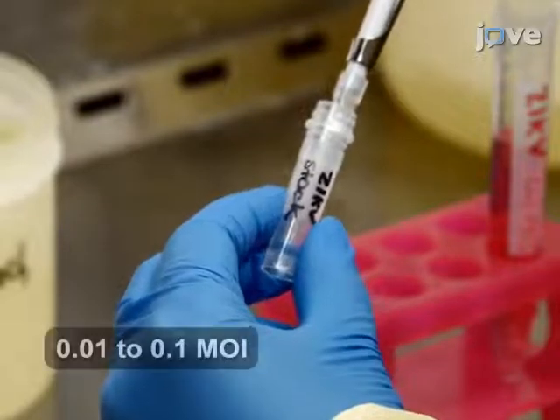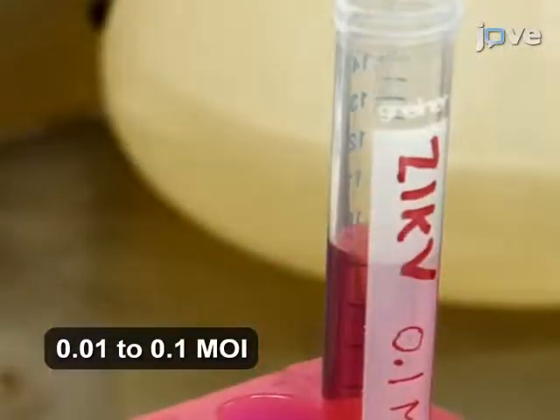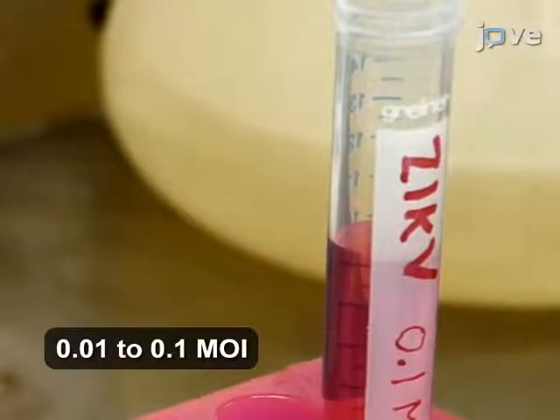The next day, prepare an appropriate multiplicity of infection of Zika virus inoculum in 10 milliliters of serum-free culture medium per flask. Safe handling of the virus is critical to prevent the spread of infection.